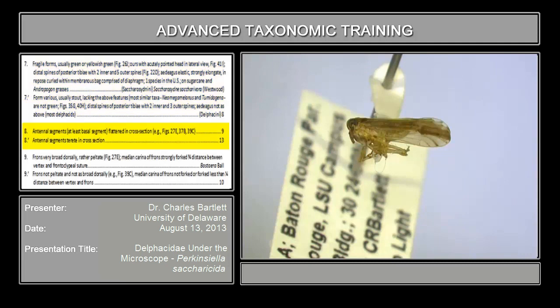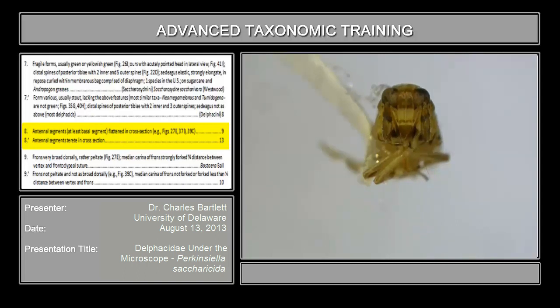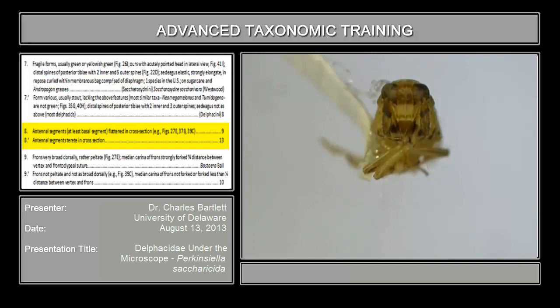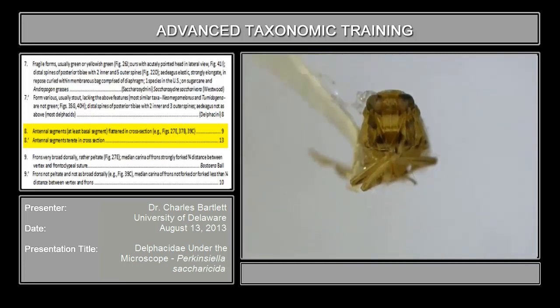Good. So let's look at couplet eight. The easiest way to evaluate couplet eight is to look at it in frontal view so we can see the antennae. Couplet eight reads: antennal segments, at least the basal first segment, flattened in cross-section, or antennal segments turrite, which means rounded in cross-section. Looking at the antennae, you will discover fairly quickly that these antennal segments are flattened — you can see it reasonably well, particularly on the right-hand side. So antennal segments flattened; we go on to couplet nine.